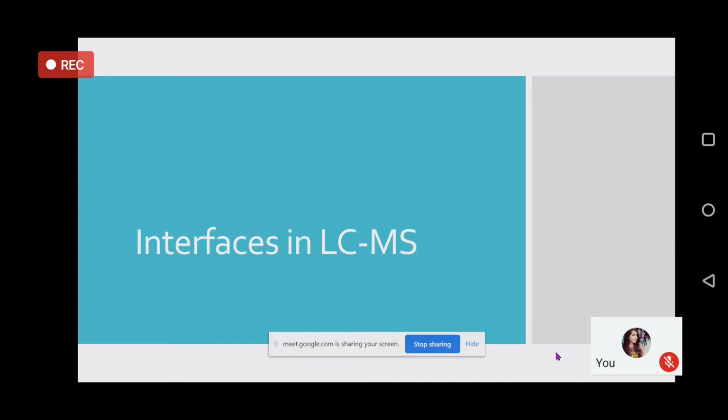Then the second question, many of the students have not understood. I purposely wrote T1 plus T2 and T1 dash T2. The reason was that T1 dash T2 always represents a hyphenated method, where T1 and T2 are the two techniques used. So T1 dash T2 will always represent a hyphenated technique, and T1 plus T2 will represent use of two techniques, one after the other, for the same sample. That was the difference I expected.